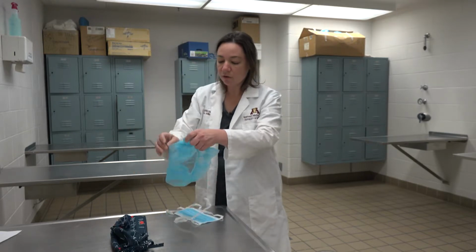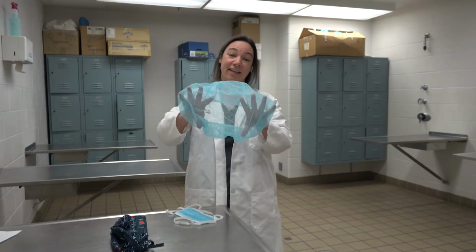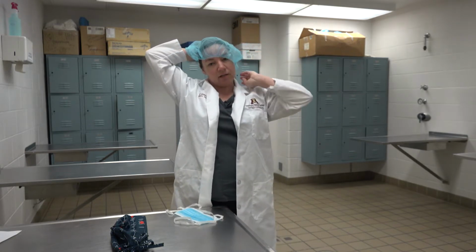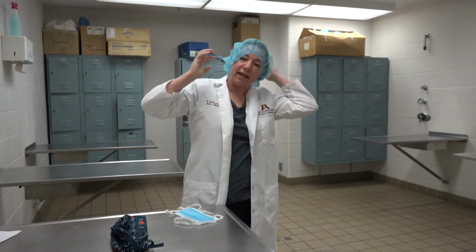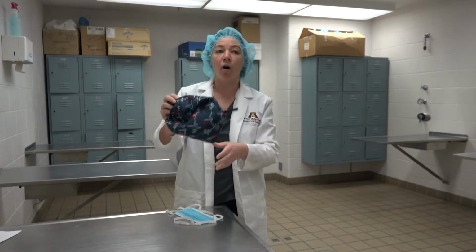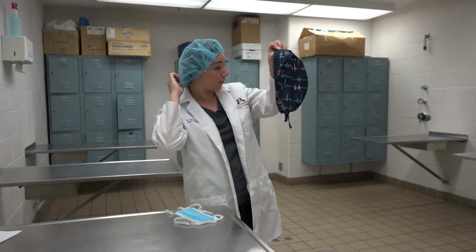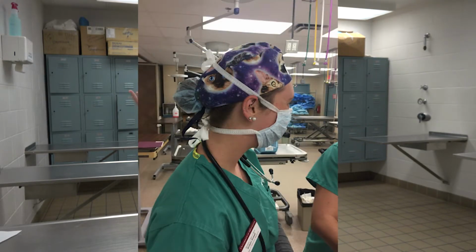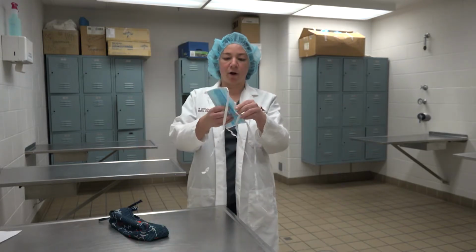So what you need to do is put one of these lovely ladies on to cover up your hair. So we can do this, all hair included in the mask. Now, if you still want one of these super awesome things on, it can go over the top. And we can show you a picture of how someone successfully did that with long hair, still maintained their cuteness in surgery. All right, then we put our mask on.